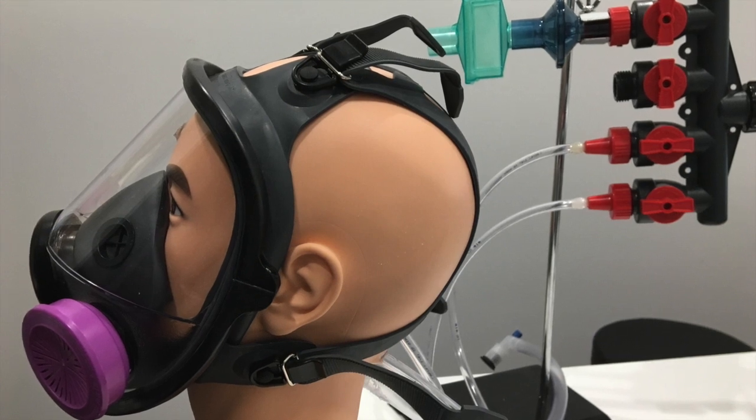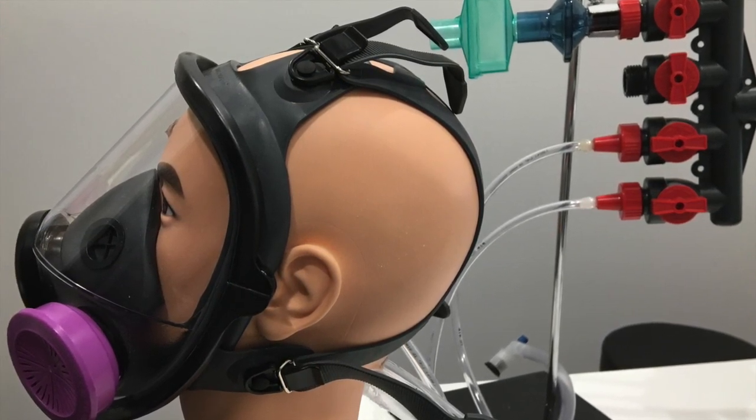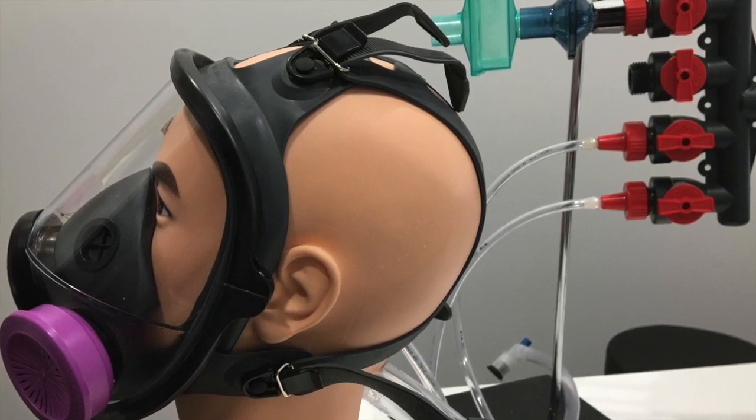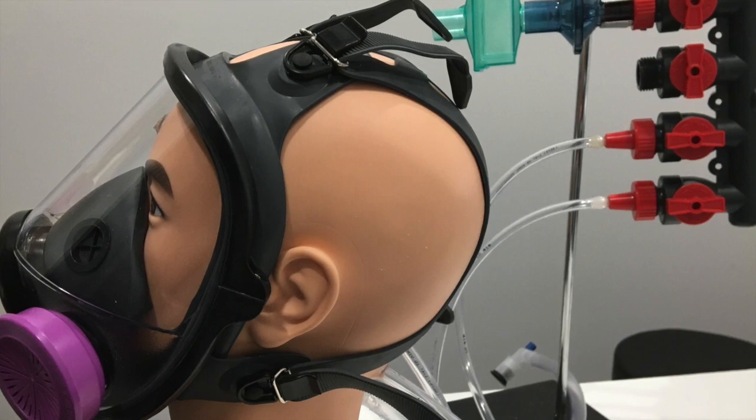The rubber is fairly soft and relatively comfortable, and I think it's pretty easy to tighten this one. One notable downside is that the exhalation valve is not filtered and it doesn't have a vocal diaphragm or voice diaphragm for speaking.